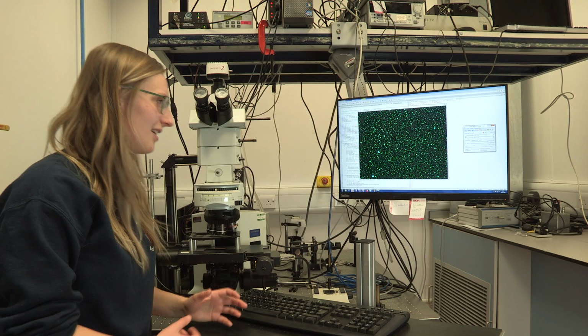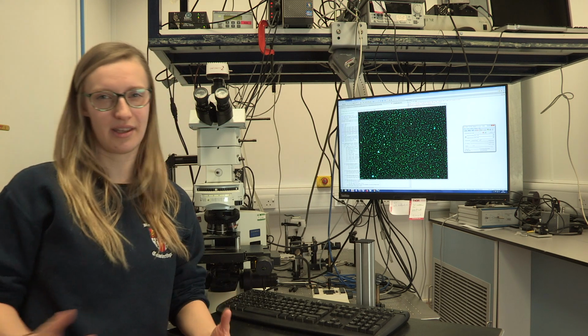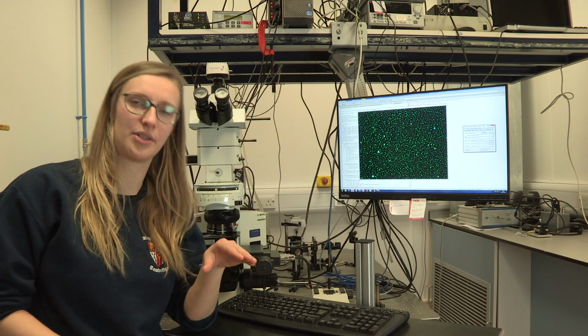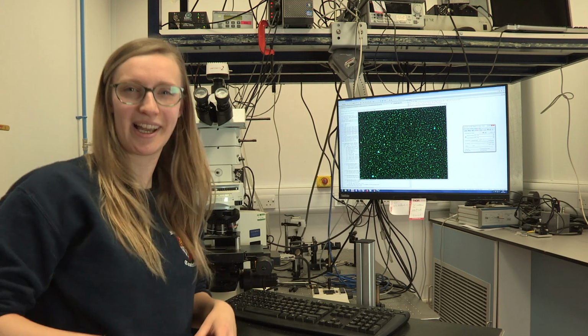You are currently looking at the rig, as we call it, the optical setup that I use for a lot of my experiments. Now, essentially, this is Raman. Raman is a type of spectroscopy. What happens is you shine a laser onto your sample. That excites all of the bonds in your sample. I mean, I'm doing this, but this is kind of exactly what happens.